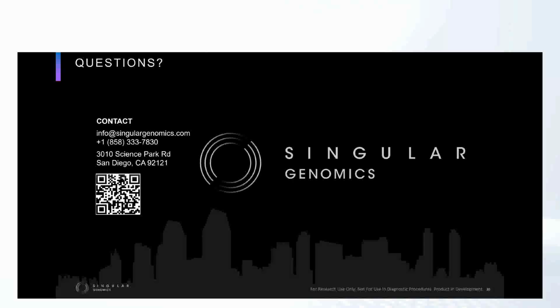Now I mentioned the other modality, which we call direct sequencing, or direct seq. That's where we're doing gap fill sequencing. Instead of just seeing the binding region and counting those, we're actually sequencing between them. I didn't show any examples today because it's still in development, but we do have a poster if you want to check out the website, where we see CDR3 sequences in B and T cells in tissues, and we can see clonal populations of those immune cells through the tissue. So it's a very exciting potential application of the technology.